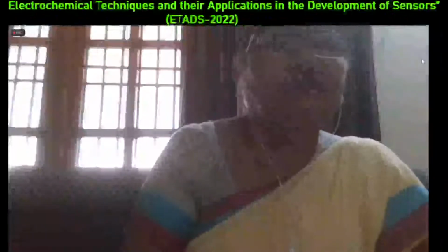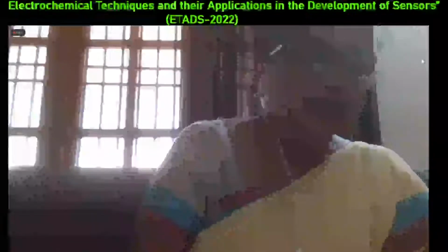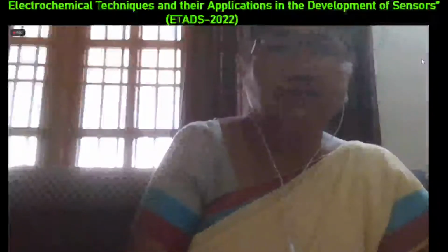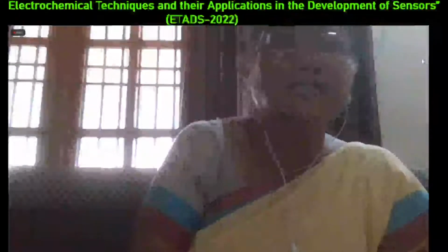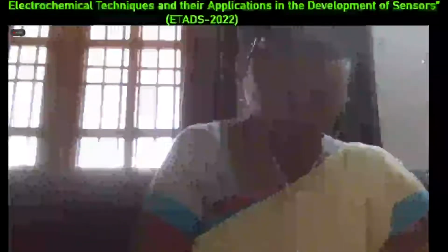Sir, actually, it's a very interesting and useful talk for our group. Thank you very much for your interesting talk. I have some small doubts, sir. During the sol-gel process, there is an increase in the pH at the interface during the deposition of the film. But sir, are you using any in situ technique to measure the pH increase during the deposition of the sol-gel film? Are you measuring the pH, sir?